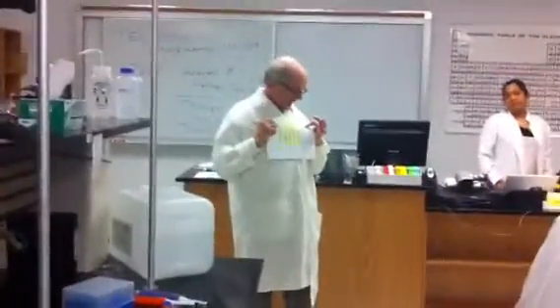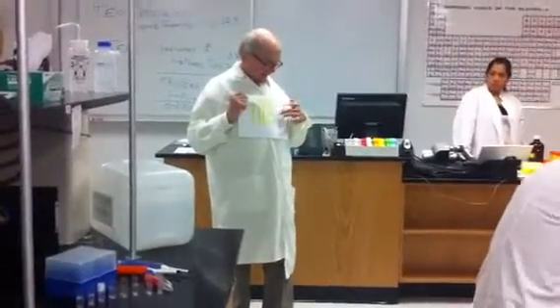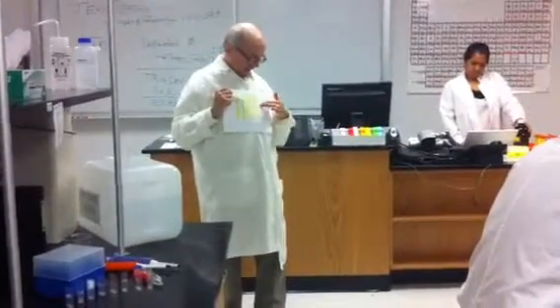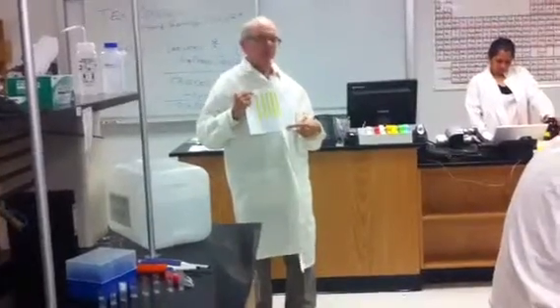Right. Now, I also warn you that I got lazy. I didn't put all 5 tubes in here, 1, 2, 3. You're supposed to have tubes 2 through 16. See, so there should be 5 curves out there like that. So we're expecting back the raw data. Then we're expecting back these graphs.